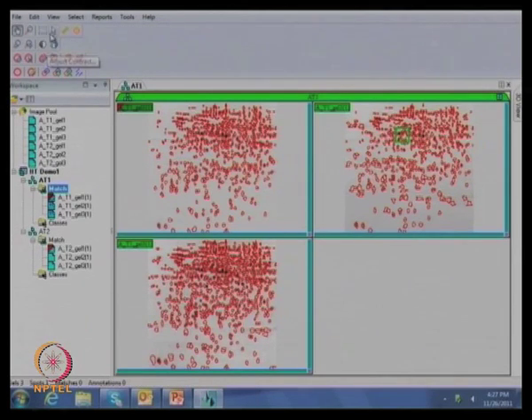Let me select a particular area. I'm interested in this particular area. I've selected everywhere, and let me zoom that. Now you can see this particular area in all gels. I think it has defined the spot boundaries quite well overall. That is why it's better to rely more on the automated detection. If you are interested in some spot, you can definitely add it.